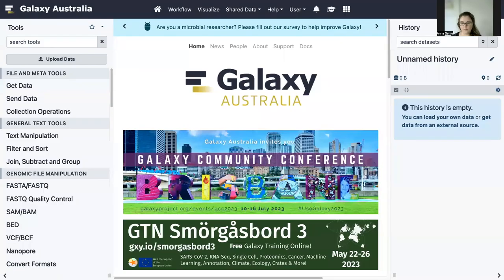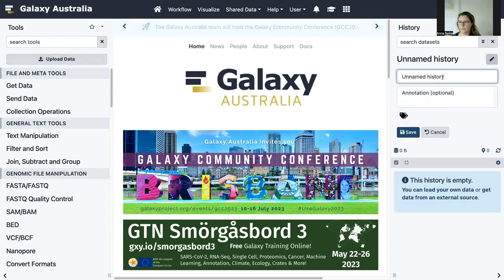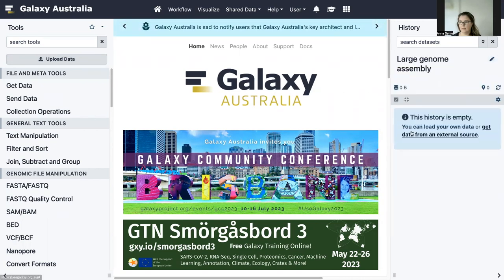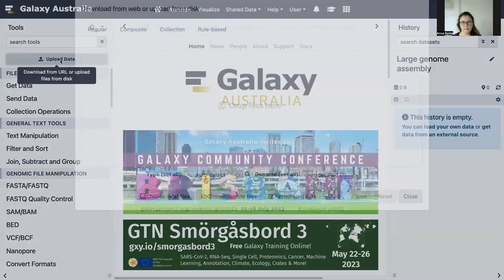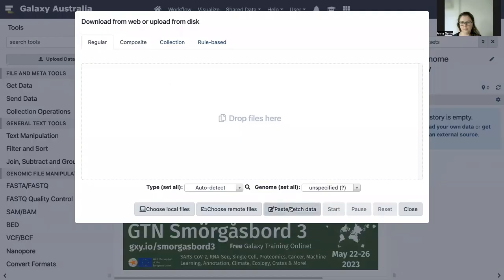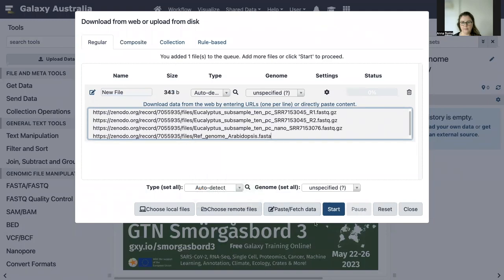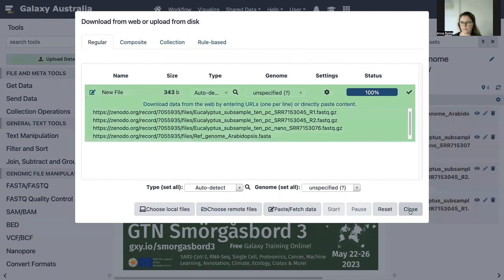Now we will start with importing the data. Let's give our Galaxy history a name. In the tutorial document there is a list of the files that we need to import, so I'll copy that list. Then I'll go here into upload data, paste fetch data, paste those file names in there, start and close.